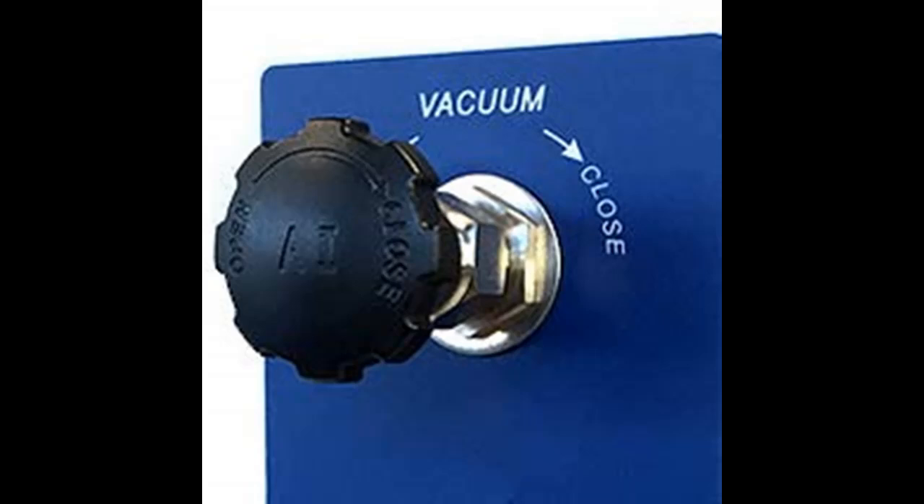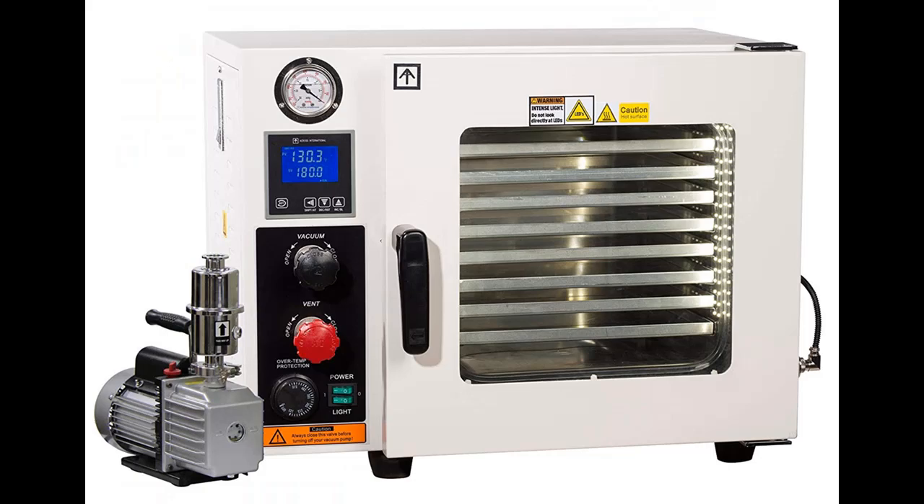which returns trapped pump oil back to the pump and makes the pump quieter to run. It is important to note that pumps should always be run in a well-ventilated area.